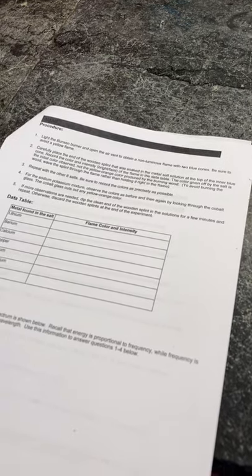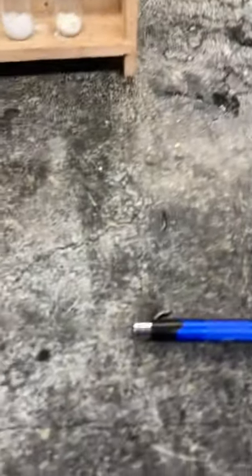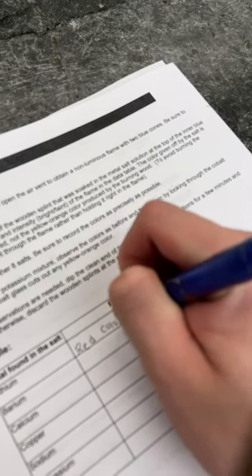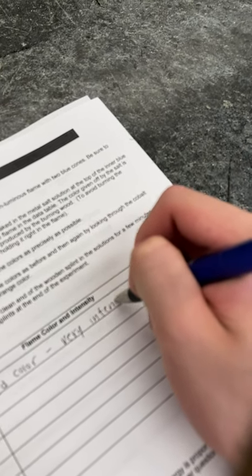Okay. Oh, yeah. Sodium? NaCl. Yep. Are we gonna write it down, by the way? Okay, we don't know the chemical names because we're just dumb. We don't know which ones are which. So we got lithium is our Li. So LiCl over here. Okay, so that was lithium. That was red. Yeah, lithium was red. Intense, right? Yeah, very intense. High intensity, I guess you could say.